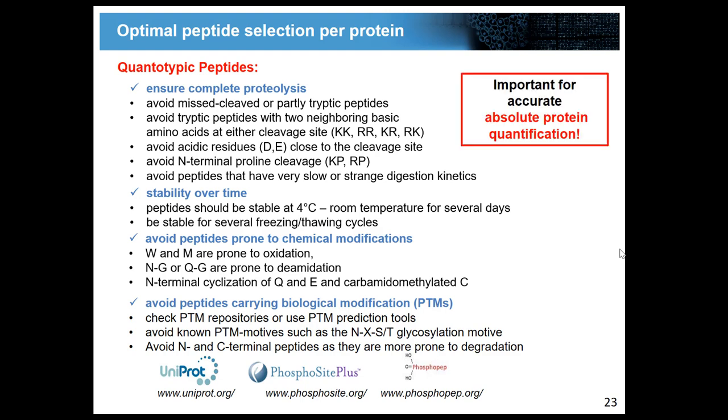However, when you want to do absolute quantification, as we just discussed, so if you want to work with a peptide to determine the protein copy per cell number of a protein in the sample, any error that happens on any of these things will immediately impact your results, and you will immediately get it wrong. That's also one reason why, even though you quantify several peptides for a protein, they might give you all different values, and it's very tricky business.